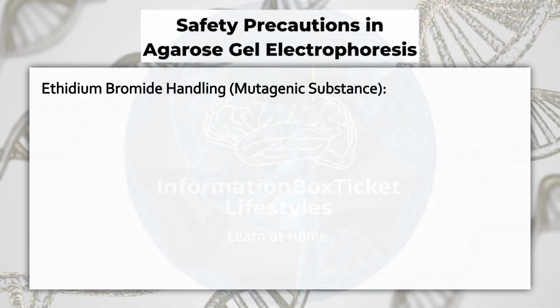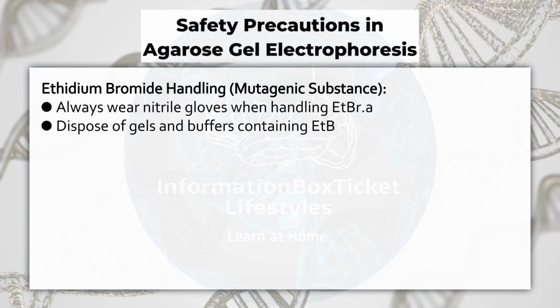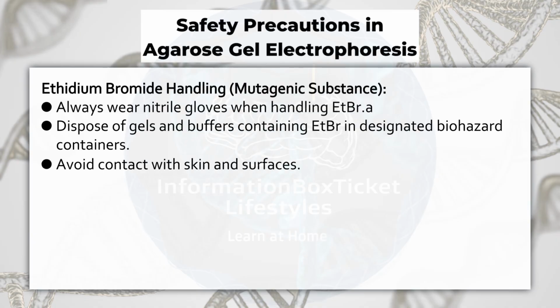Ethidium bromide handling, mutagenic substance. Always wear nitrile gloves when handling EtBr. Dispose of gels and buffers containing EtBr in designated biohazard containers. Avoid contact with skin and surfaces.